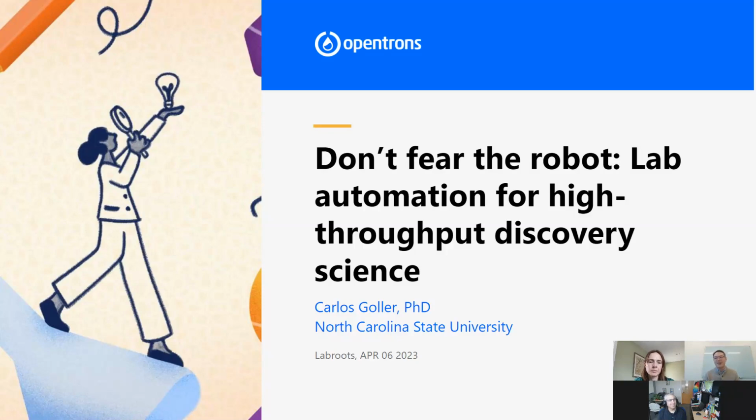I always recommend, from customers or those that come and ask us, what is the need that the robot needs to meet for your lab or for your business? And then how to ask the right questions, right? Ask the right questions from the instrument vendor, from Opentrons, from Zymo.